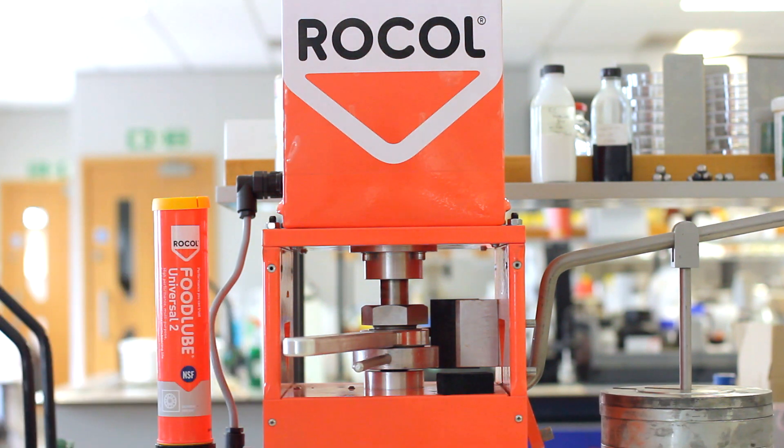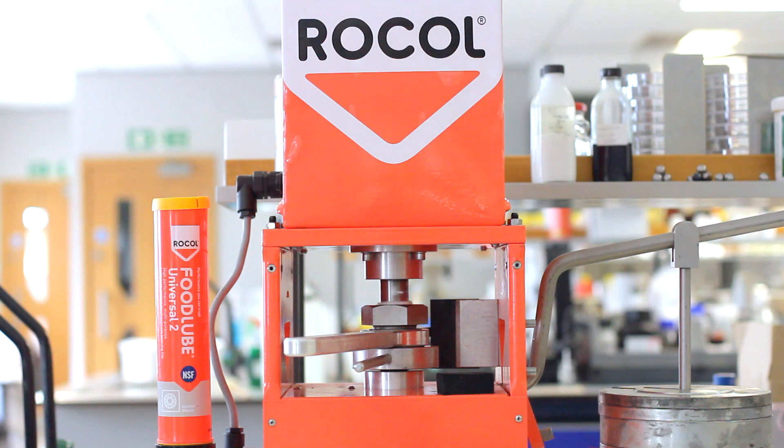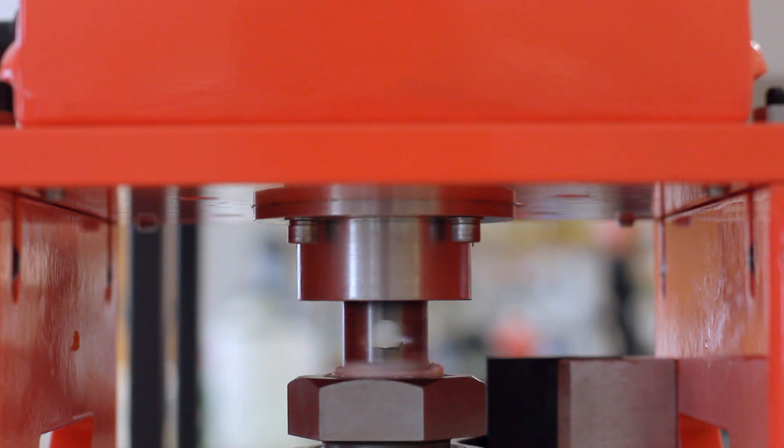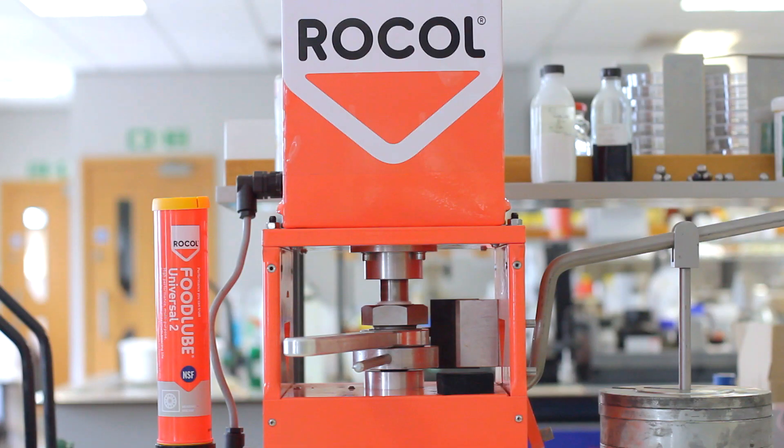As you can see the balls don't weld but the test runs smoothly and stably until we stop the machine after a few minutes and it could continue to run because of the high performance protection system offered by the food lube universal 2.